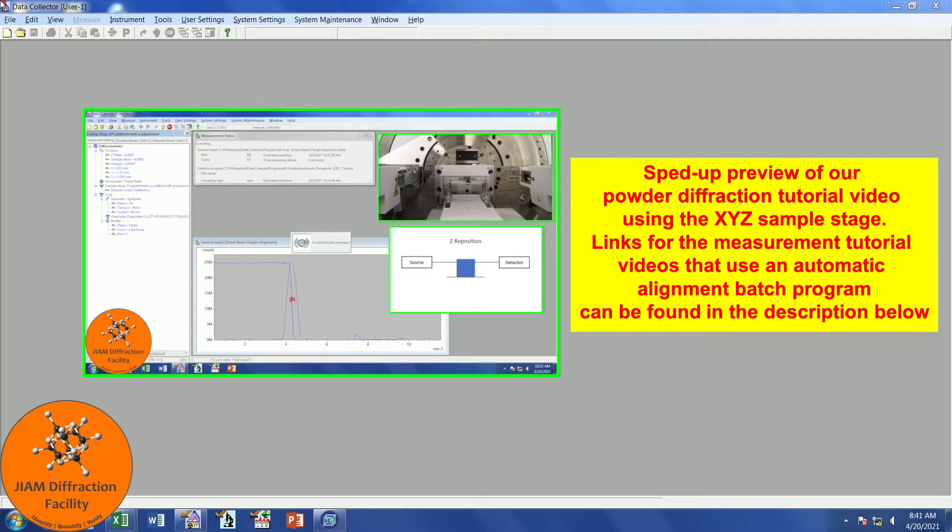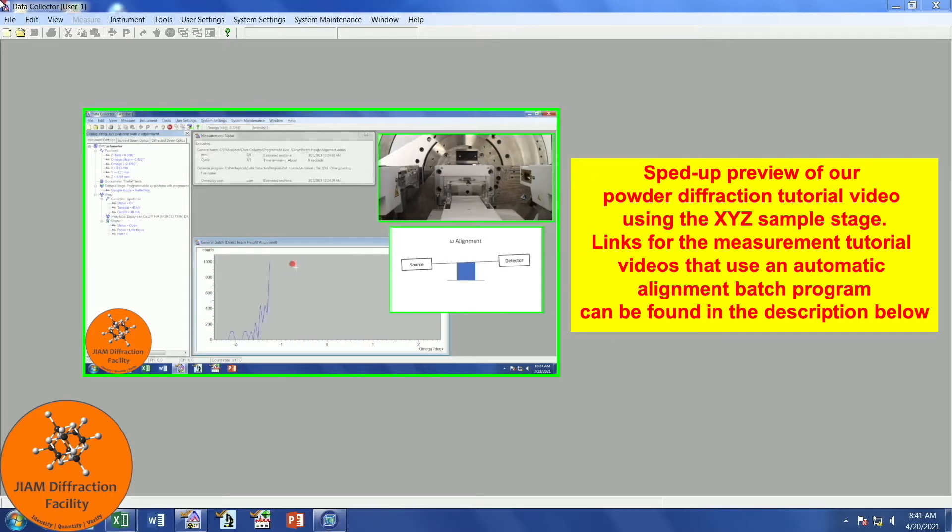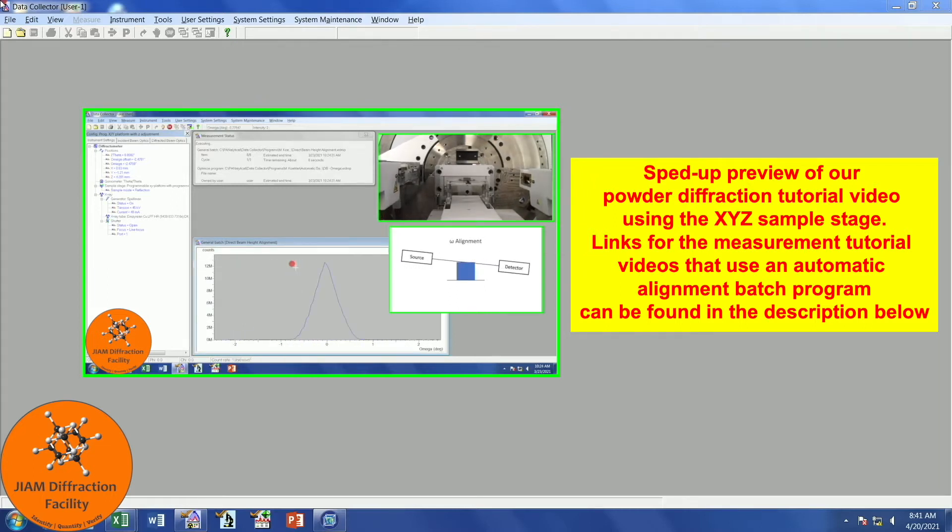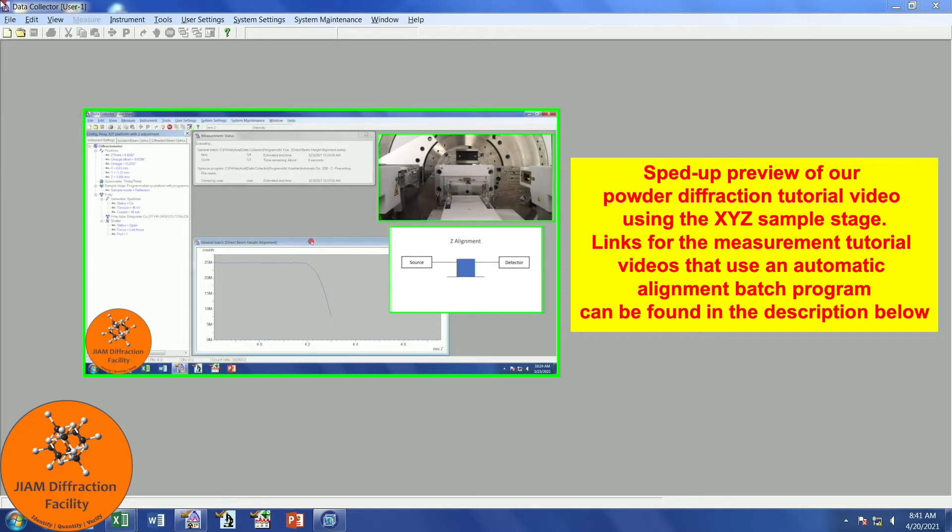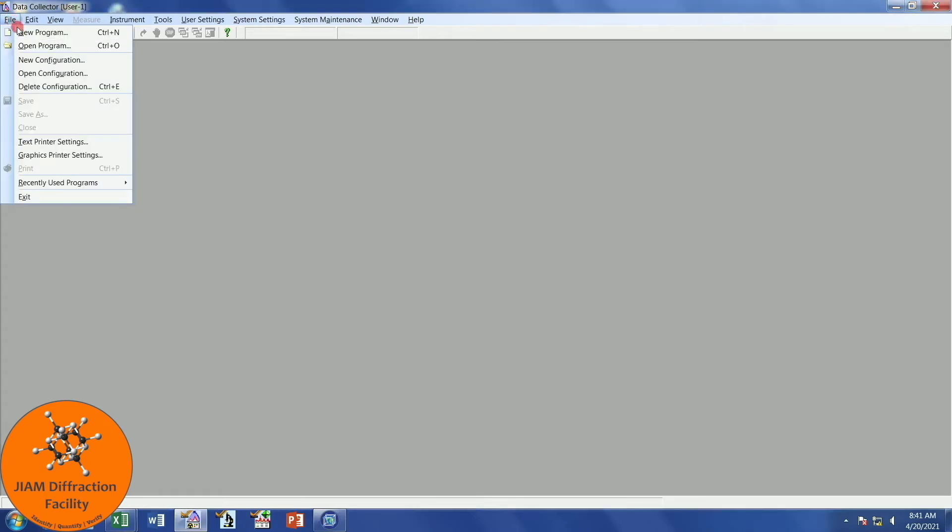We will first set up individual measurement programs, and then insert them into a batch program. To begin creating the individual programs, we can click either this button here, or go to File, New Program.